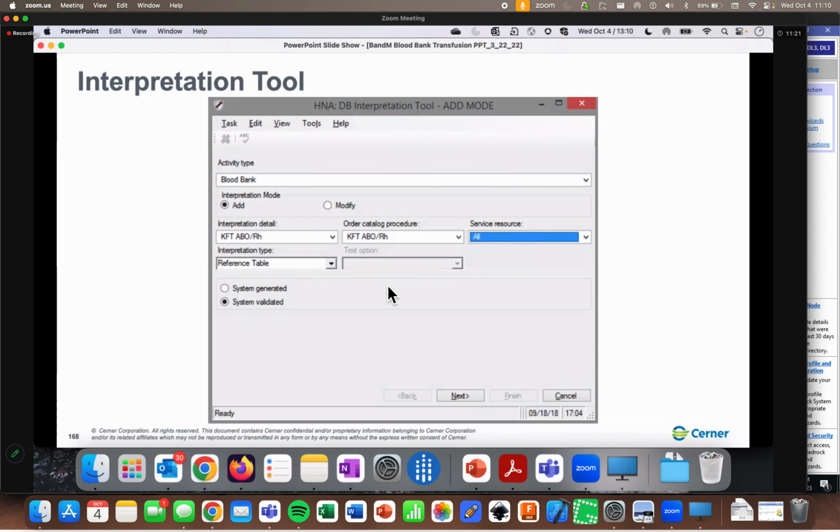Right? So if you try and build different interpretations for your individual benches and instruments, you can. The tool will let you. Result entry isn't going to work. Again, result entry does not like it if there's more than one row per DTA on a table. And so while, yes, technically it's possible with the build, it don't work.